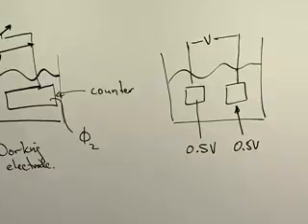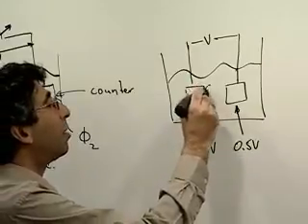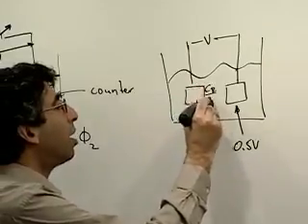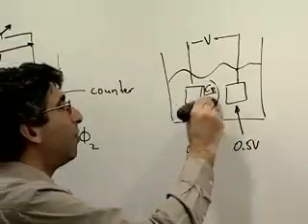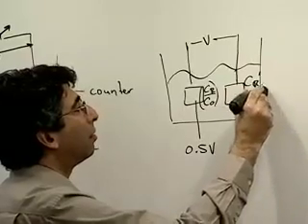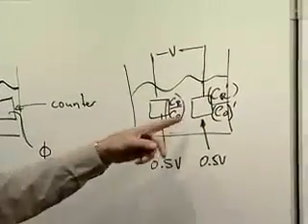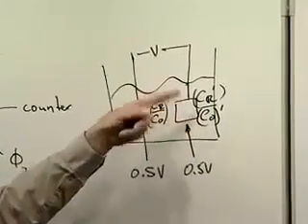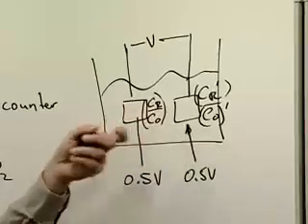But as soon as I start the experiment and a current flows in this circuit, of course, the ratio of reduced to oxidized changes at these two electrodes. So the quantity at this interface and the quantity at this interface are different. And of course, the Nernst equation tells us that if we have different oxidized to reduced, we have different potentials. So these two potentials at these two interfaces are different.